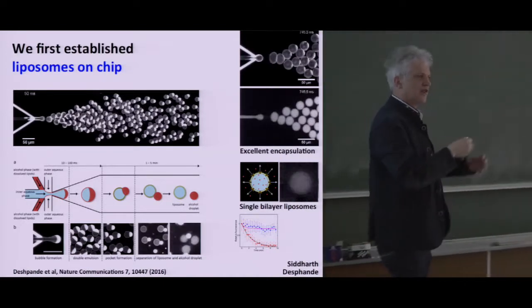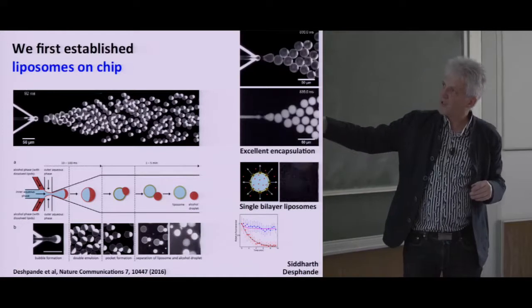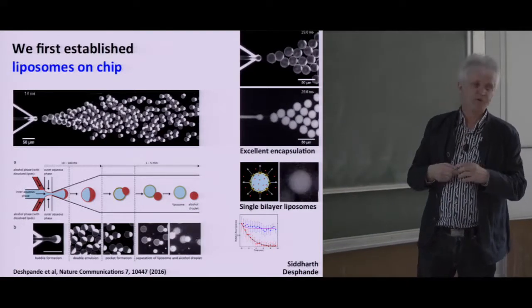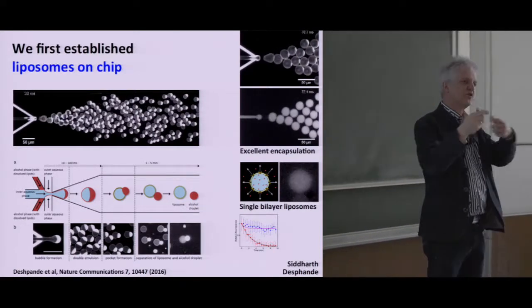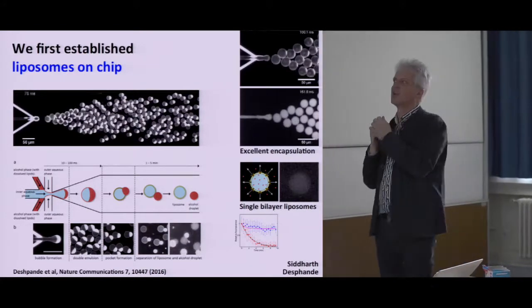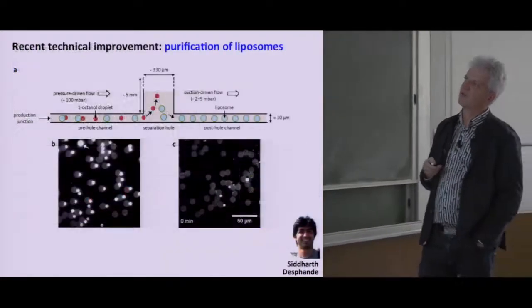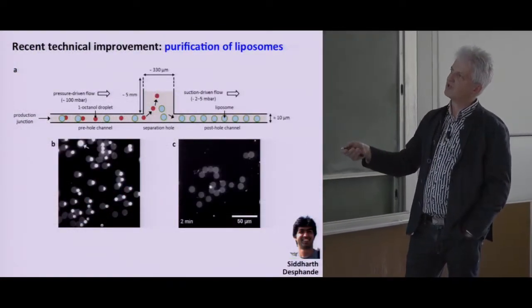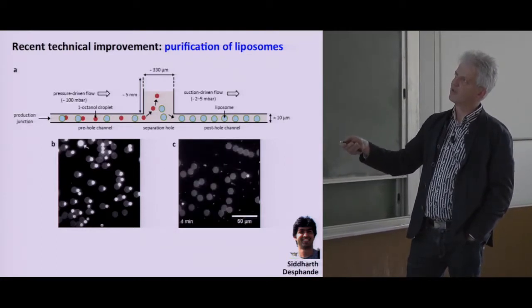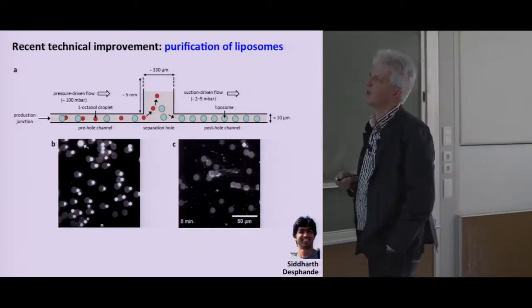So after a few minutes we are left with perfect liposomes filled with the liquid from the inner aqueous solution. This is well known from droplets, water in oil. There are many people doing this, but to get liposomes it's a bit more delicate and interesting, and we now have a new technique to do that. We are working on better and better structures, getting them purified, getting rid of those octanol droplets by simple density purification, worked by Sira Despan, a postdoc in my lab.